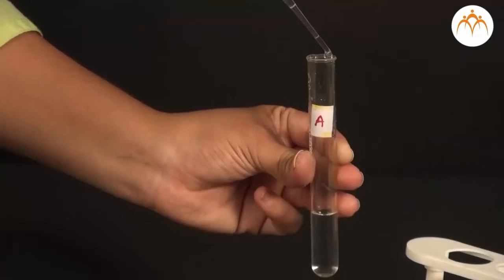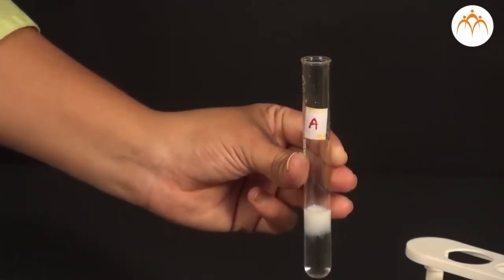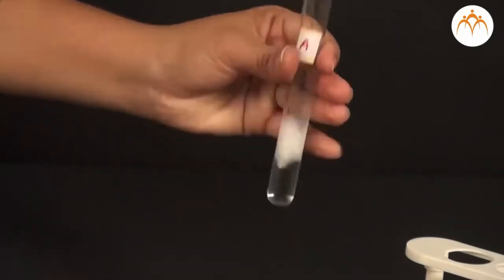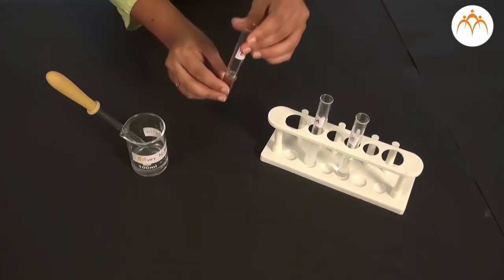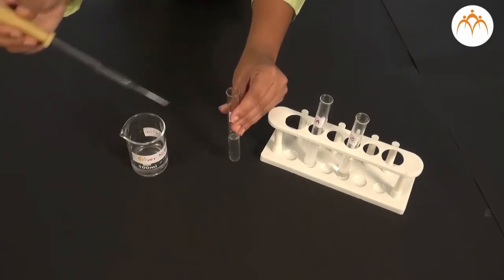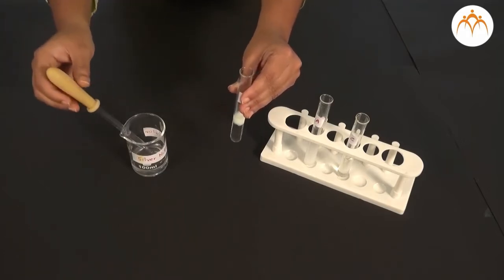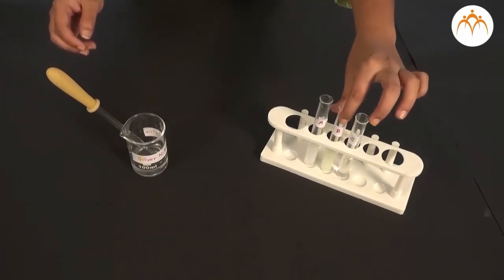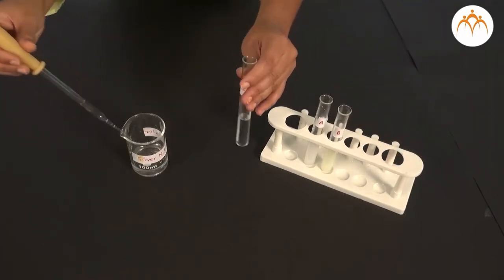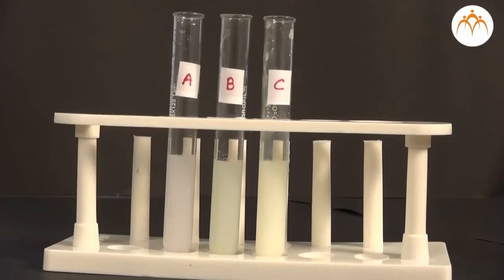As soon as you add silver nitrate, we find that a chemical reaction starts and some product is developed. This product is not a liquid but it is solid. Such a solid product that comes out of the solution is known as a precipitate and the process is called precipitation. In all 3 test tubes you will find precipitates. It means that when silver nitrate reacts with these 3 compounds or solutions, a precipitate is formed. This indicates that there is a possibility that there may be halides or compounds of halogen in these 3 solutions. These halides are giving us precipitates.